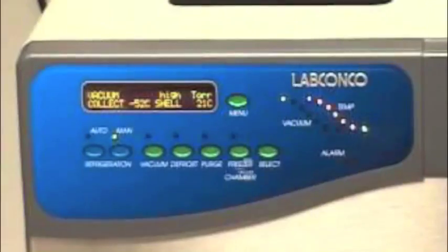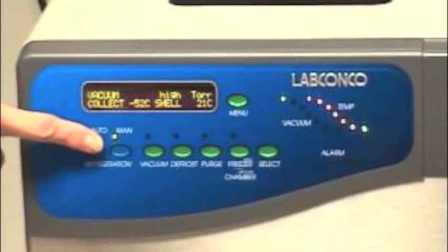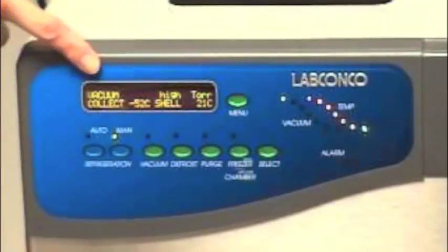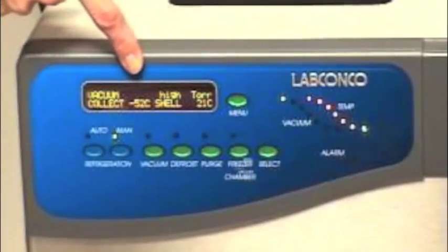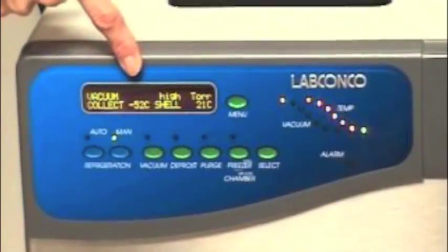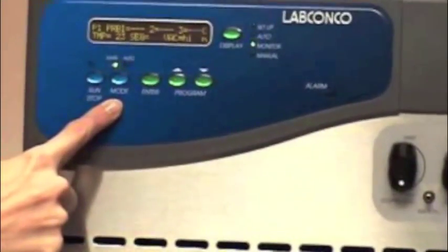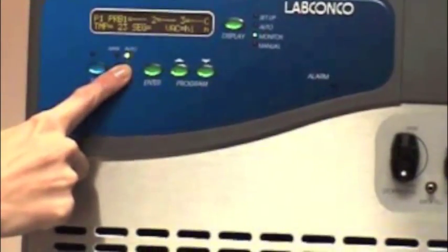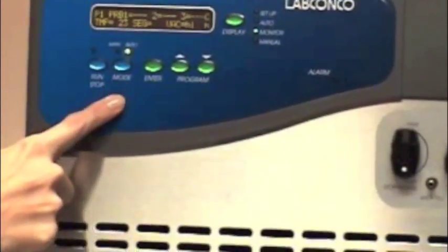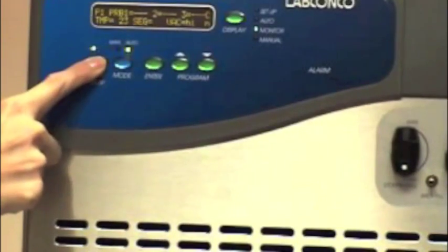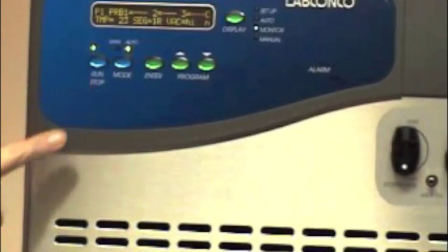In manual mode on the base unit, allow the collector coils to reach at least minus 40 degrees C. Press mode on the stoppering tray dryer to select auto and run stop to start the program. Now lyophilization begins.